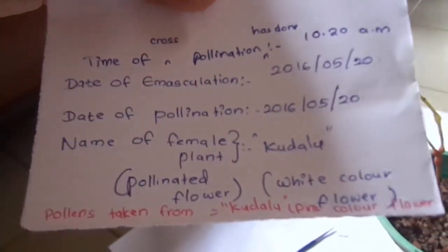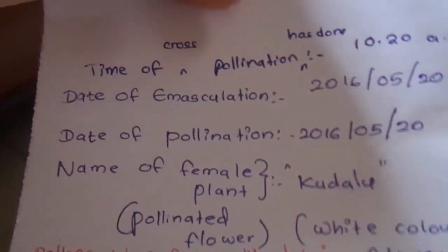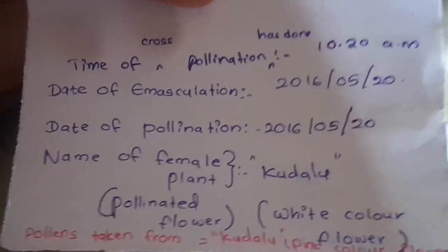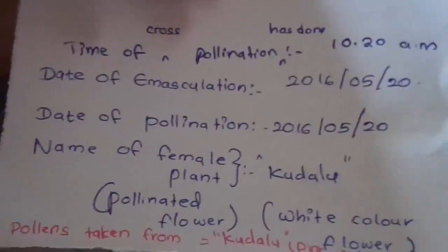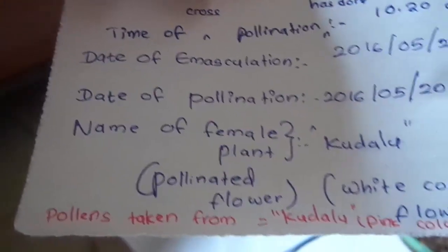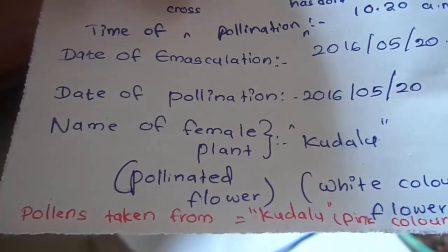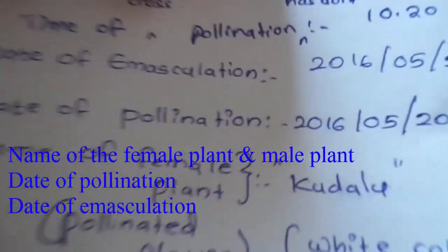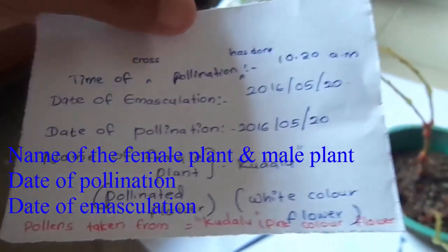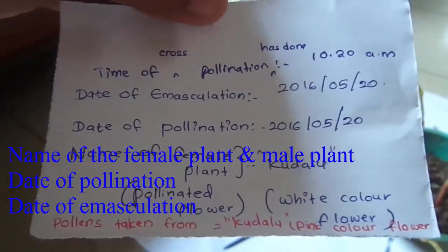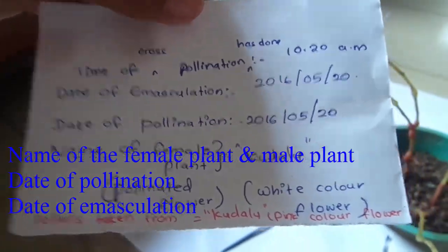Next is to tag and label the flower. Tagging is done to record information about the pollination. The basic information included on a tag is the name of the female plant and male plant, date of pollination, and date of emasculation.